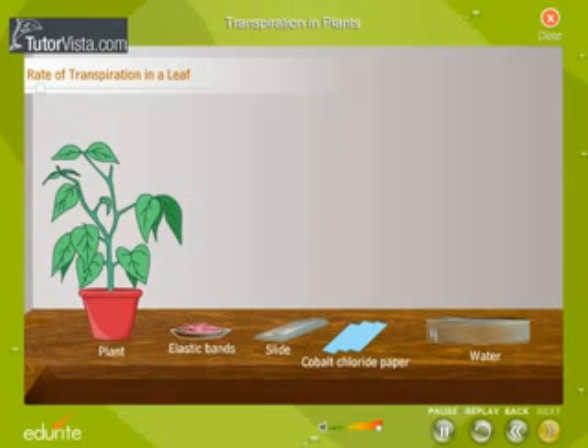This activity will show us that both surfaces of the leaf do not transpire at the same rate. We use cobalt chloride paper to test for the presence of water. Cobalt chloride paper, which is normally blue, turns pink when it comes in contact with water.